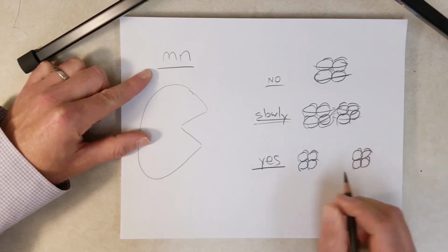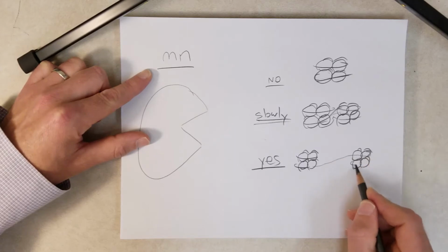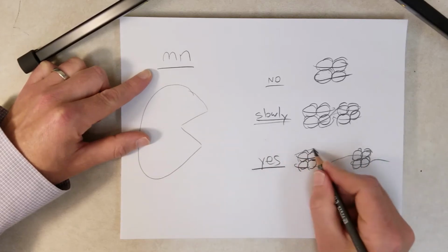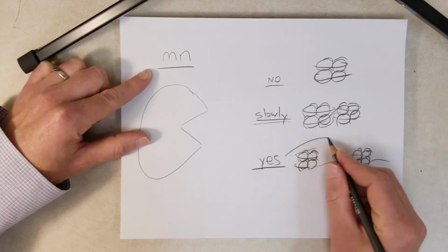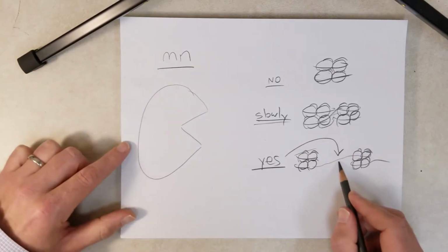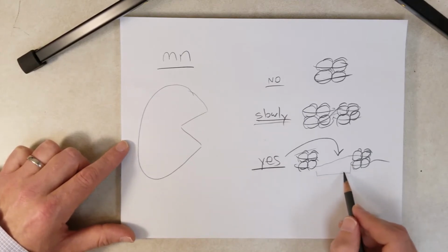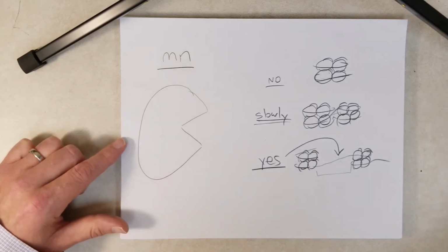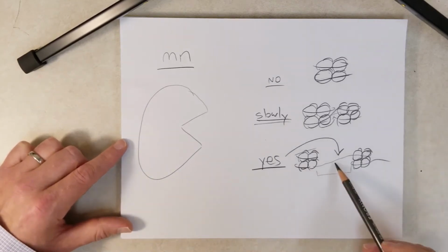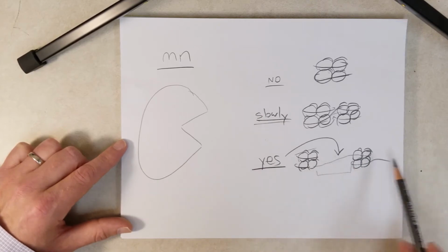My octamers are getting sloppy. Sorry. So it's not good at digesting the DNA associated with the nucleosomes, but very good at getting the linker DNA when there's some space here, when there's a pretty good amount of space between there. Micrococcal nuclease can get in there and digest that. And the longer the linkers, the quicker it can get to that linker DNA and separate these two nucleosomes.